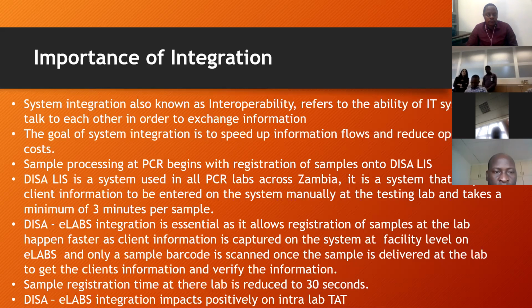So eLABS DISA integration is essential in that it allows registration of samples to happen at a faster rate, as client information is captured at the facility upon registration of these requisitions on eLABS. And only a sample barcode is scanned once the sample is delivered at the lab to get the information that was already registered and verify the information for us to do the registration on DISA Lab at PCR in readiness for processing. Next slide, please.